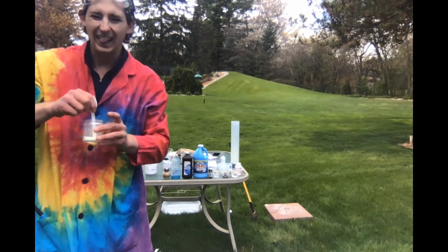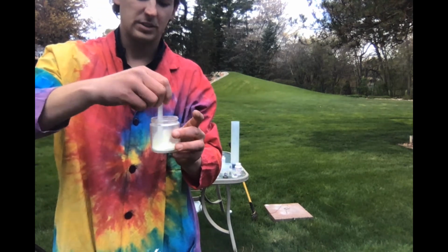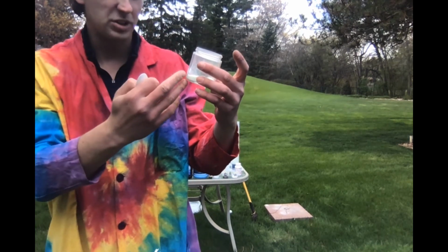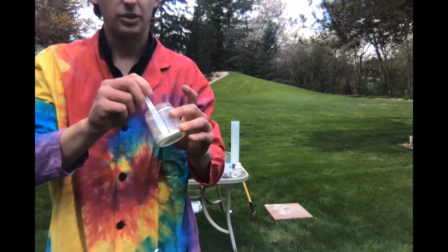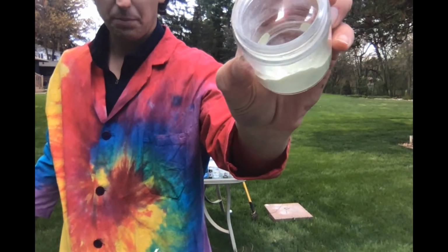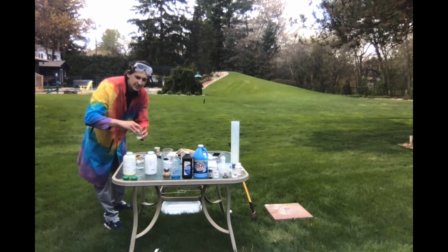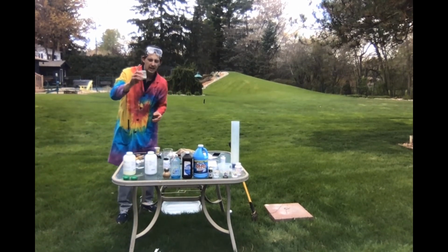The sulfur is yellow, okay, the potassium chlorate is white, all right, and I'm just mixing up these two chemicals, okay. The color has changed a little bit. The mixture is turning a lighter yellow color, and this is what you see, okay? We're going to put this aside for now and use this at a different time, all right? But those are the observations that I would do for number 5, grind and anvil part 1.